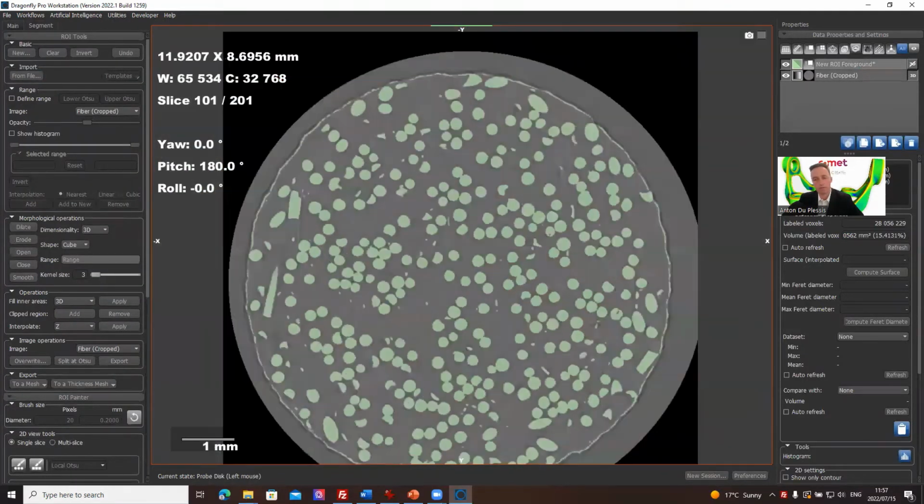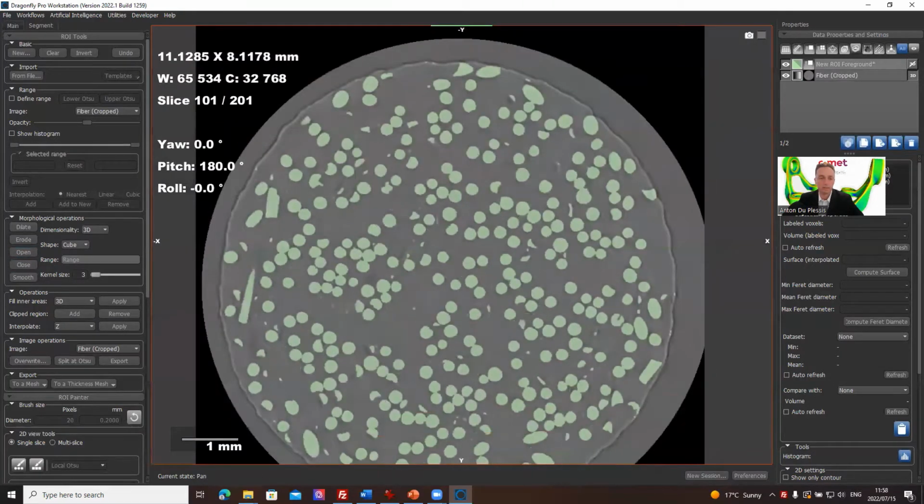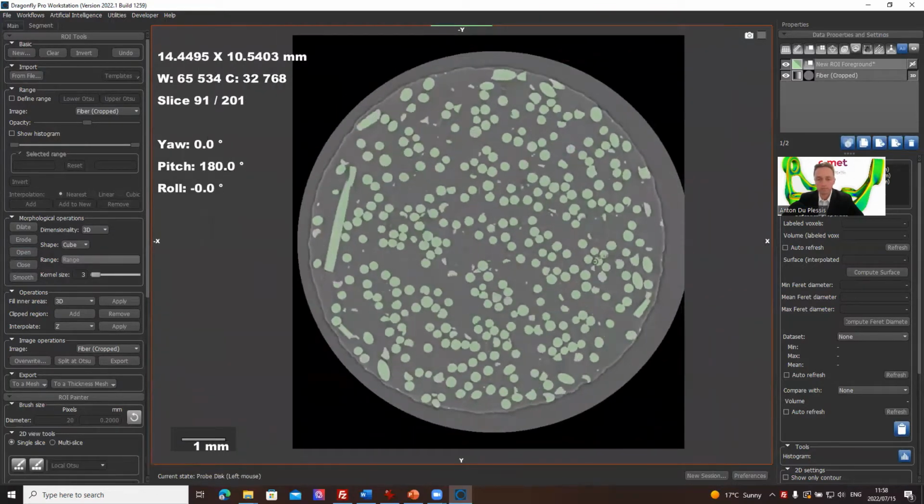Now, at the moment, we have all these fibers and this exterior there. So let's show you how to remove this bit of exterior, which we don't want. If we use an opening function, which is a combination of erode and dilate, that removes that quite nicely without changing anything else. So that's quite widely used, and in this case, it's quite useful.